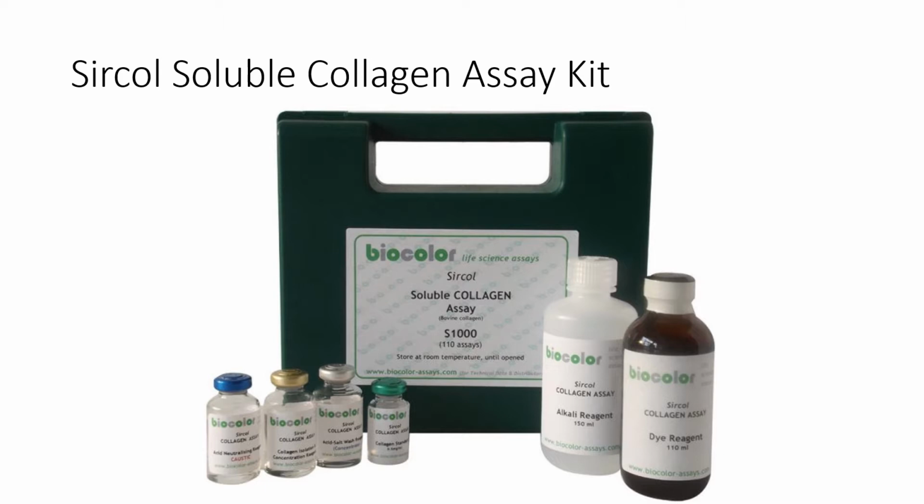Recall that in lab session 3, we made those cellular gels consisting of mesenchymal stem cells that were seeded within the agarose gel. Over the period of culture, those cells presumably produced collagen, and now we're going to measure how much collagen was produced.